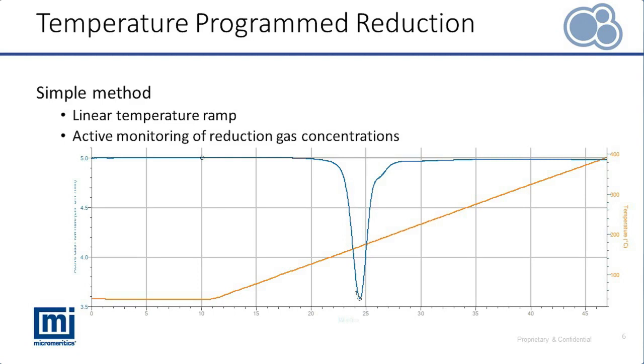2. The peak temperature, shapes, and number of peaks. Notice there is a dominant peak followed by an overlapping shoulder at higher temperatures. And lastly, amount of reduction. With calibrations applied, peak integrations can quickly quantify the amount of reducing gas consumed during this TPR.